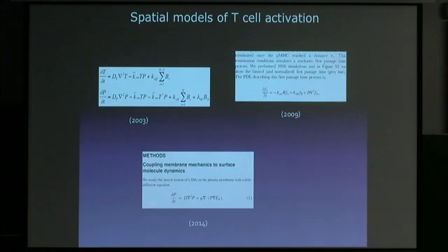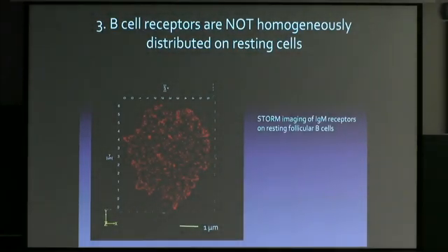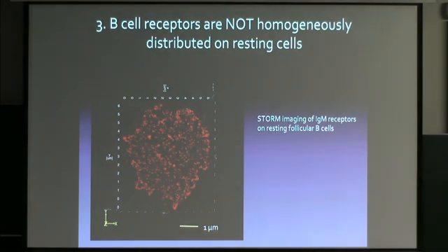And this is a paper here from 2014. There's a bit of mechanics in this paper. But again, you've got this diffusion operator. You've got the sense that things are sort of being blurred out and smeared around. And we have sort of a field approximation. Okay. The problem is that when you look closely, things really don't look like a field at all.